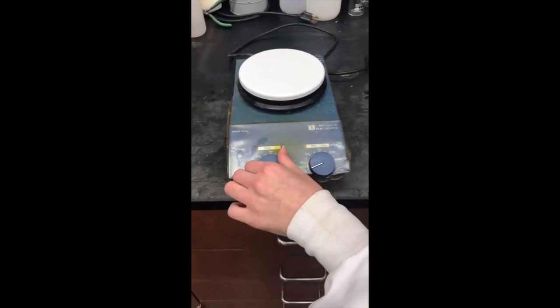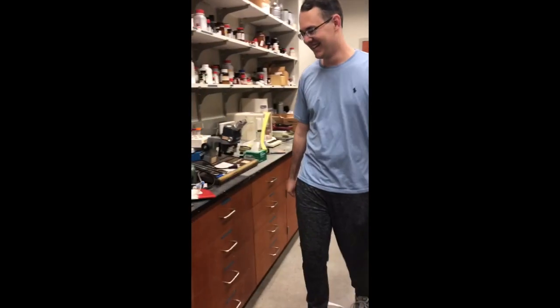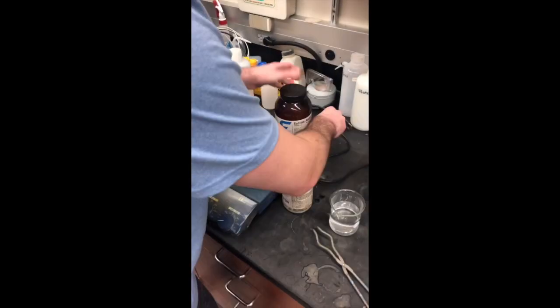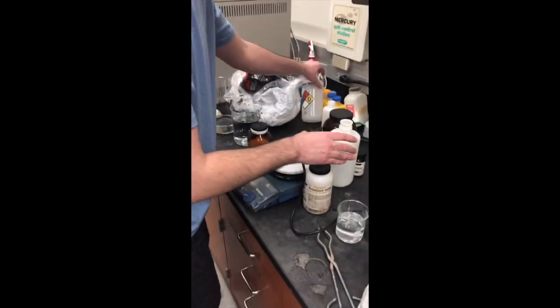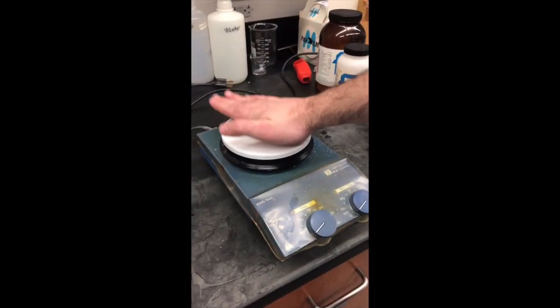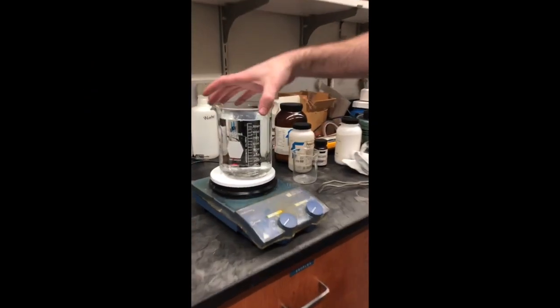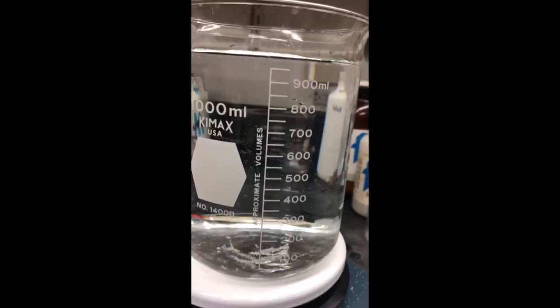Make sure to turn off your hot plate when you're done using it. Don't overcrowd your workspace. Absolutely don't touch the hot plate. We don't want to fill our fingers above the fill line.